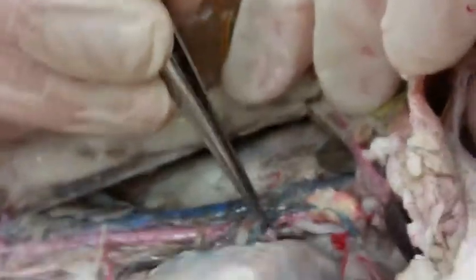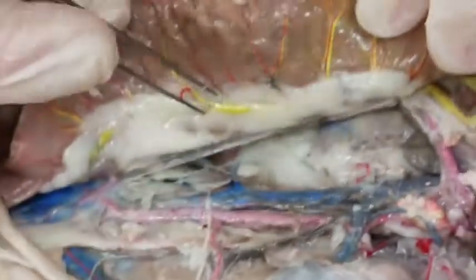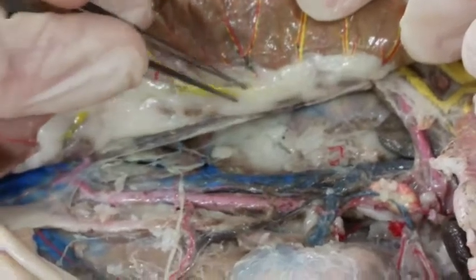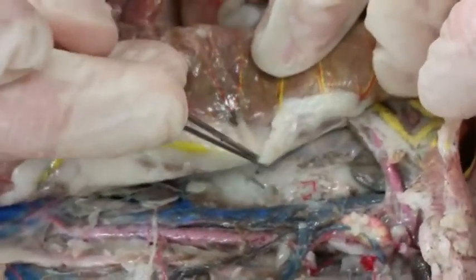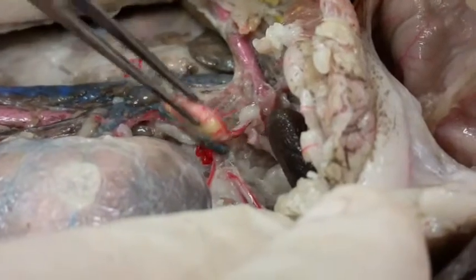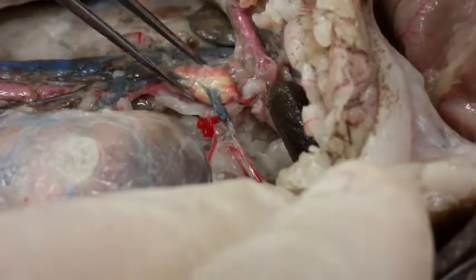So we have renal artery, and renal veins right there. The cranial mesenteric vein is right here. It's going to flow underneath this fat. Halle Berry, for any of you who are not aware yet, Halle Berry was a very fat cat. See one of our adrenal glands right here, kind of just hanging out by one of the veins near the kidney.